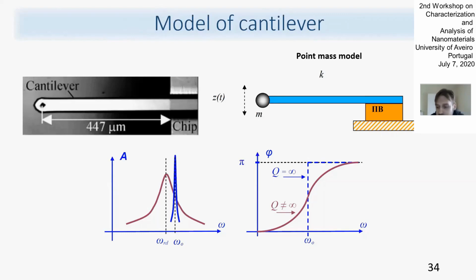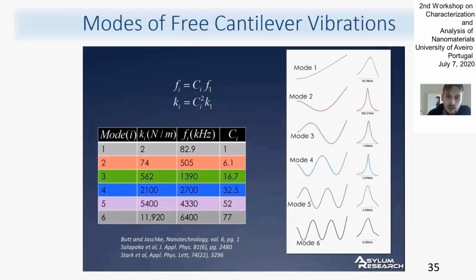And this makes sense. So this gives us a unique opportunity to measure really small signals by tapping mode. And if we go into more detail, actually there is not only one free mode. As with each vibrating object, you have different modes of oscillations, and all the other modes also have some physical meaning and can be used as well for the amplification of the signal.